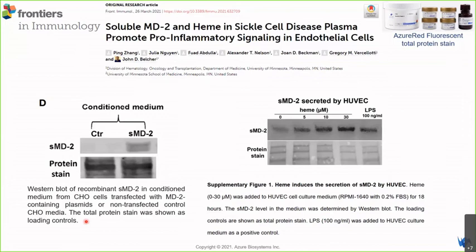And this is a figure that we got from their supplementary data. Instead of a single protein, which we normally see in housekeeping protein data, for total protein stains you are showing the band pattern at a similar molecular weight range. Just show the band pattern, and then they will know that yes, this is a total protein stain. So this is very easy and straightforward.